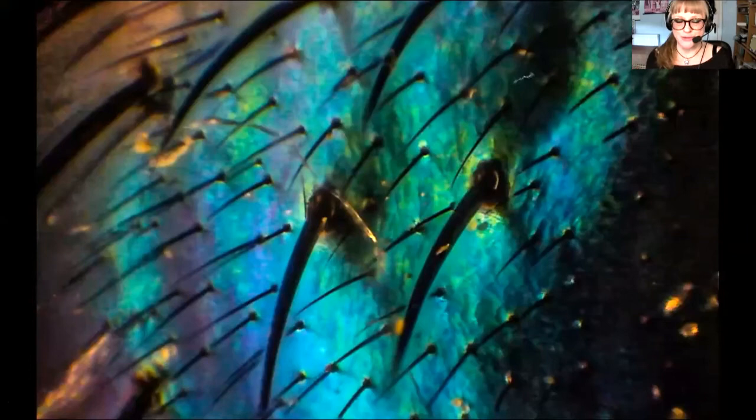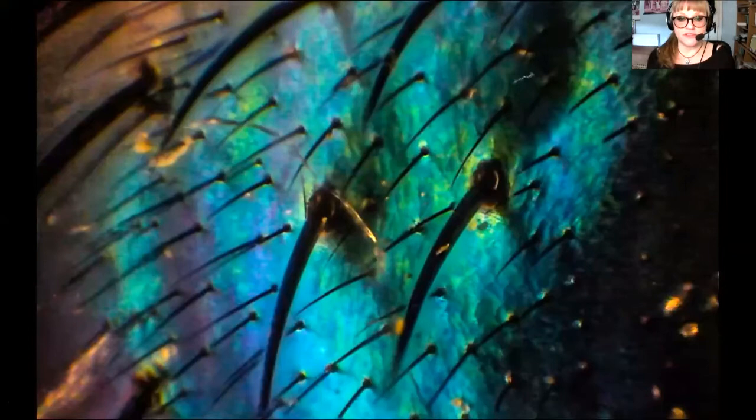For the rest of this video, I'm going to just put together the video clips that I used and then the stacked result afterwards, so it'll give you an idea of the sorts of things that you can do. This was taken with a histology microscope which is really not designed for this sort of microscopy, but I'm really pleased with the results I got out of that imaging run that day. I hope you found this helpful. I'll just run the video now and you can just have a look at some of the videos and the stacked frames that I got out of it.